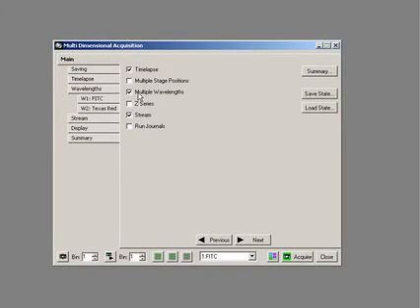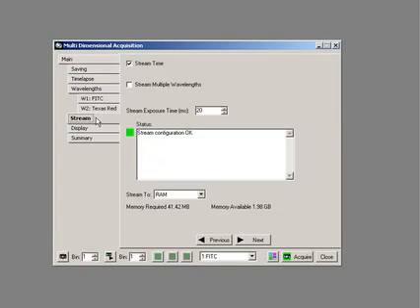If we enable wavelength, what we'll find under stream now is that we have stream multiple wavelengths as well. This may be that you're going as quickly as you possibly can, maybe you're doing a ratio experiment, something like that.